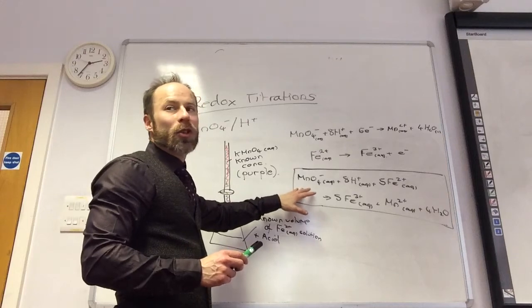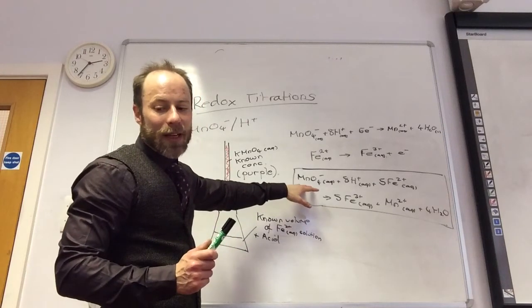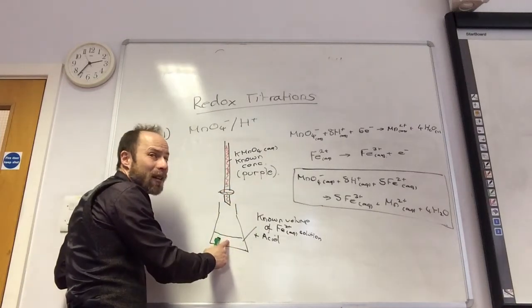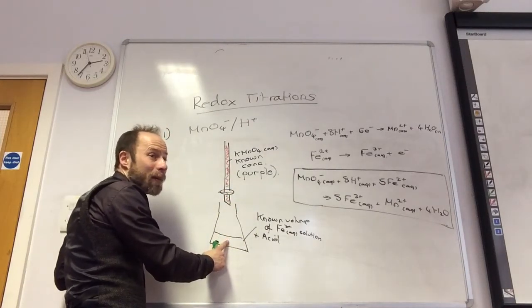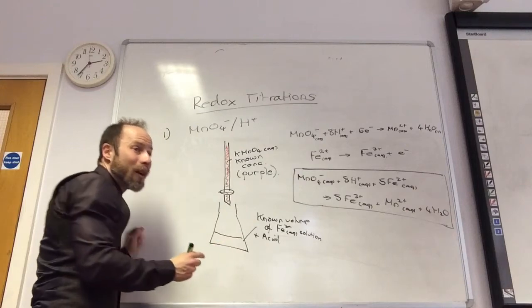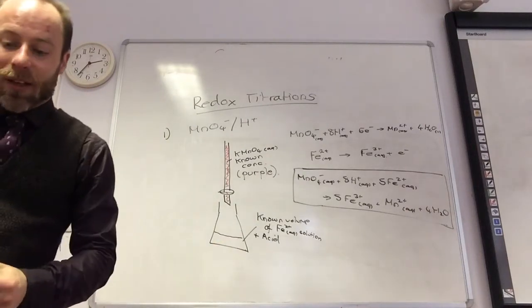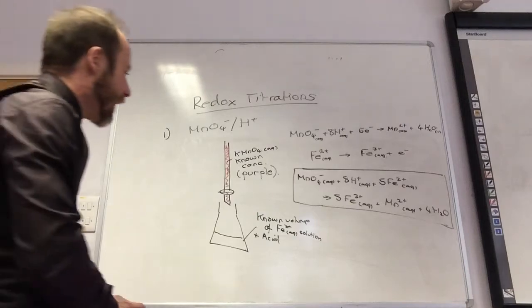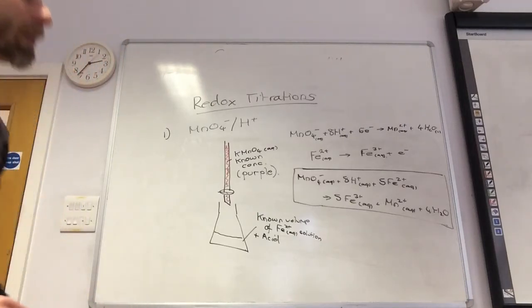So what do you see happening? Well, this is purple. As it hits here, it reacts to become colourless.